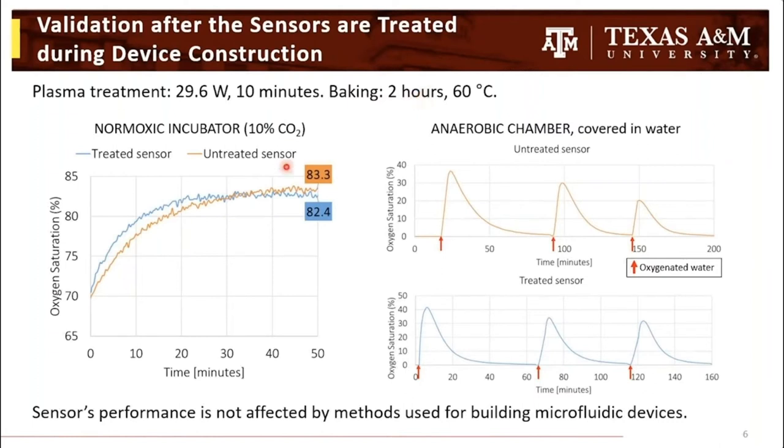taking readings. Right here on the left, you can see the final values that the sensors reached when they were placed in a normoxic incubator covered with tap water. You can see that the final values of the treated versus untreated sensors are very, very similar. So we did not see an effect of the treatment in the static readings of the sensors.